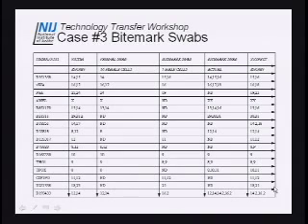Bite mark swabs. Here we have the bite mark swab, and this was the profile obtained with 7 male cells. The bite mark swab was run, and there's the profile that was obtained, compared to the profile we got from the 7 male cells. We also got the vaginal swab, with female cells, and here's the suspect's type, and you can compare that to what we got for the bite mark swab. Yes, there is dropout, but remember, we're only at 7 cells there.